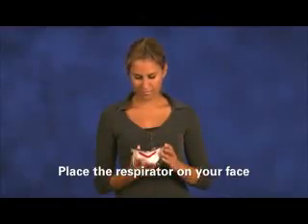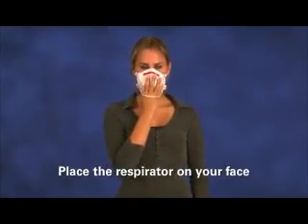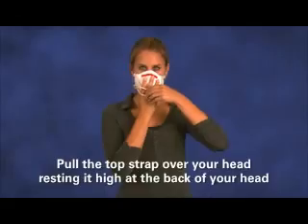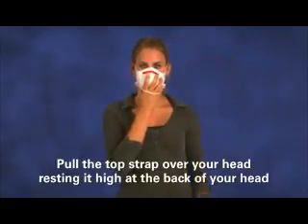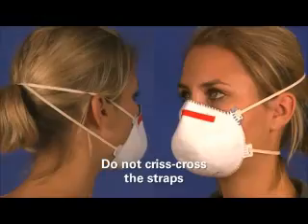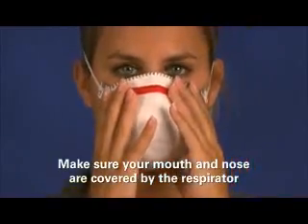Using one hand, place the respirator on your face with the nose piece at your fingertips, allowing the headbands to hang freely. The nose piece should span and cover the bridge of your nose, and the respirator should cup your chin. Pull the top strap over your head, resting it high at the back of your head. Pull the bottom strap over your head and position it around your neck and below your ears. Be sure not to crisscross the straps. Make sure that your mouth and nose are covered by the respirator.